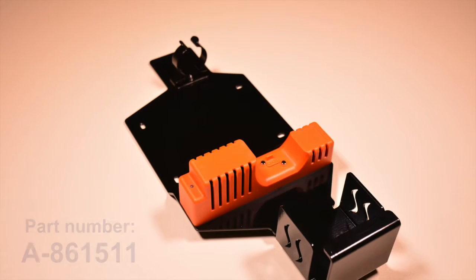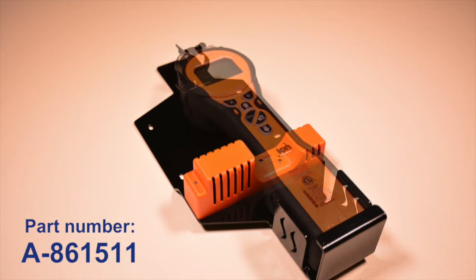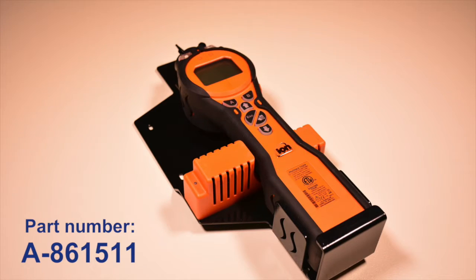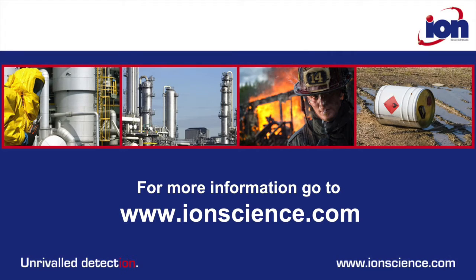The Tiger also has an optional wall and vehicle charge cradle. This is used to offer a secure charge connection when vibration may be an issue. For more information, go to ionscience.com.